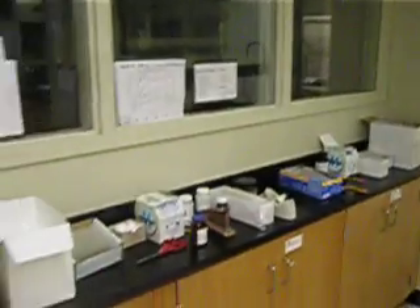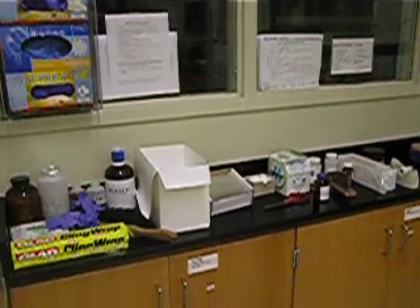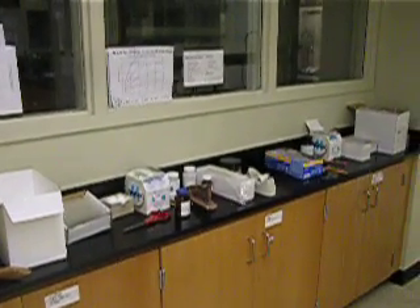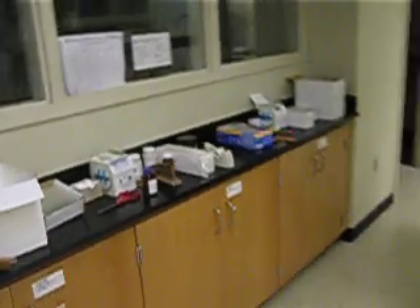We're going to move over to the general purpose bench. There will be gloves and plastic pipettes here. If you don't have something at your student work area, your drawers, or the balance, you can find it at the general purpose bench.